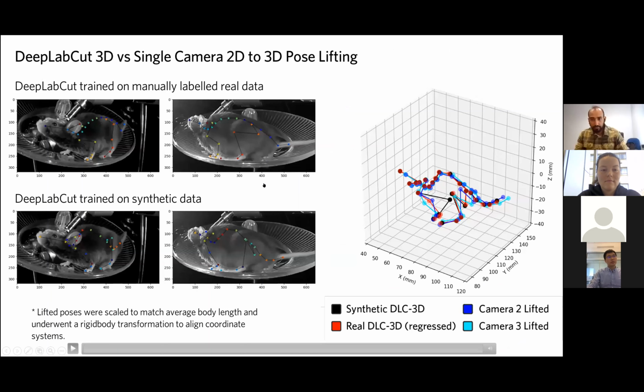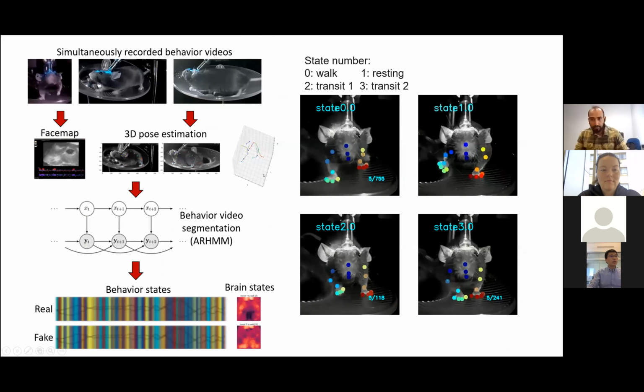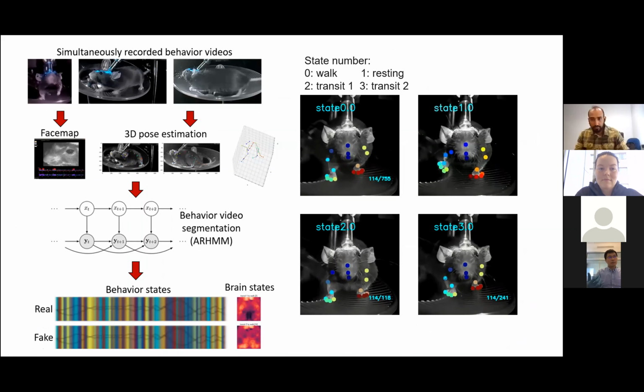Using this 3D virtual mouse, I think Xiao will present more on these projects. We can also use these 3D tracks to better classify the behavior into different behavioral states.